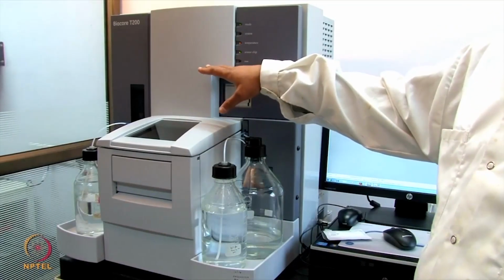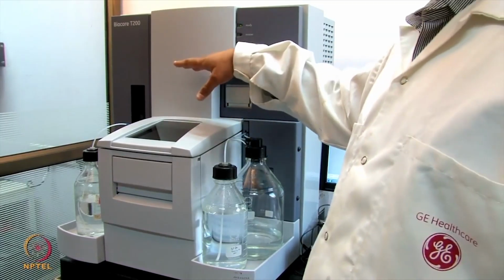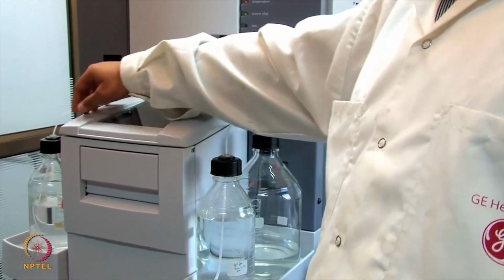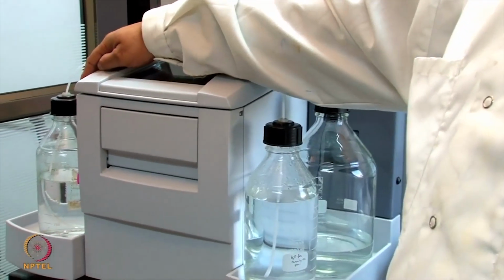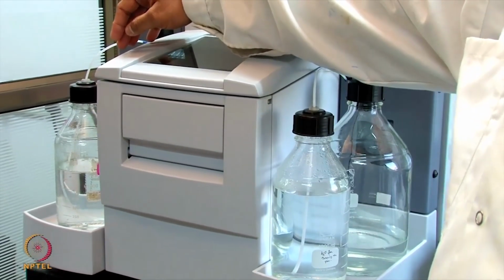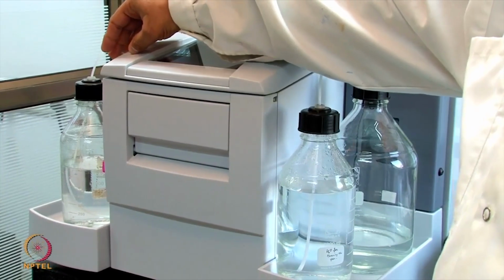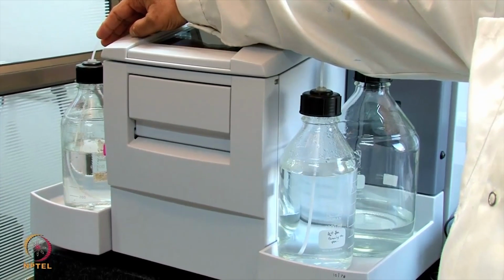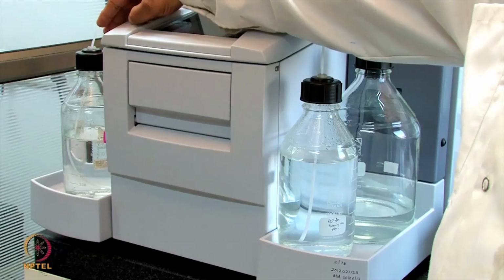So this is a surface plasmon resonance and it's a Biacore T200. So this machine has the various parts, like the running buffer is connected here, and any of the biological buffers can be connected as a running buffer. They could have any pH from low to high. So the regular buffers used in a Biacore experiment are HBS EP, HBS N, PBS for small molecule experiments.